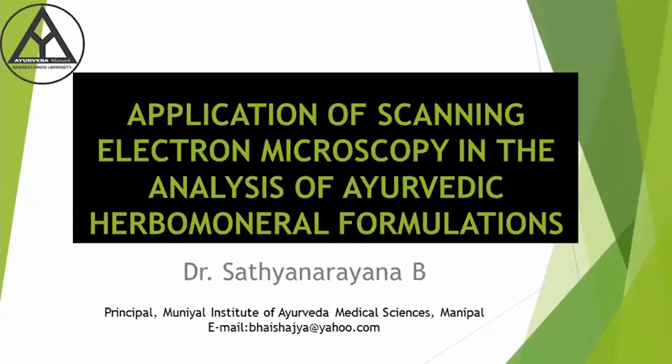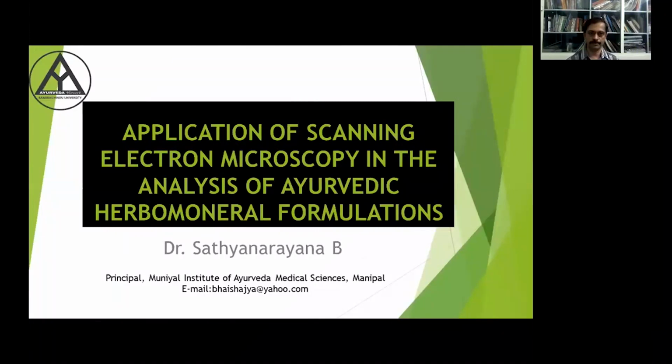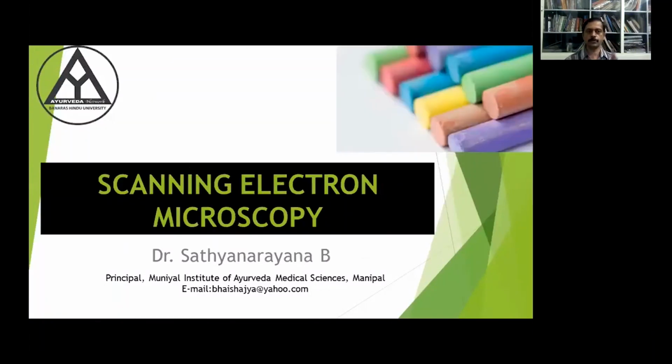As I said, the topic is entitled Application of Scanning Electron Microscopy in the Analysis of Ayurvedic Herbo-Mineral Formulations. Today I will be focusing on scanning electron microscopy specific.